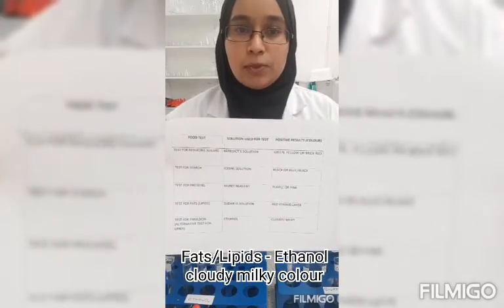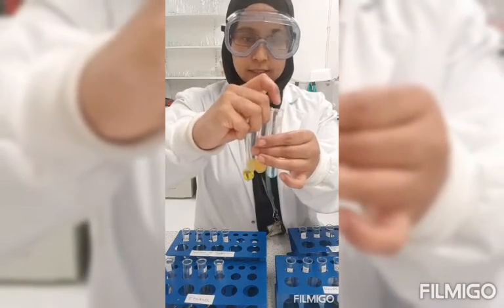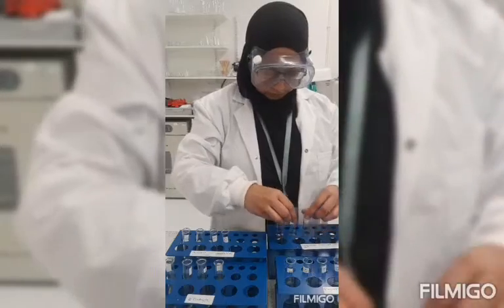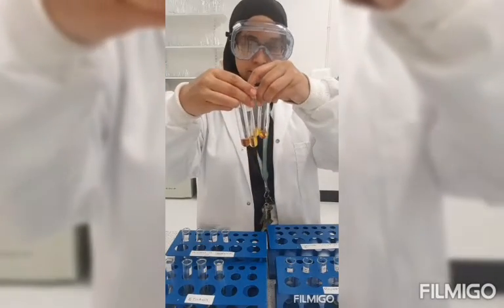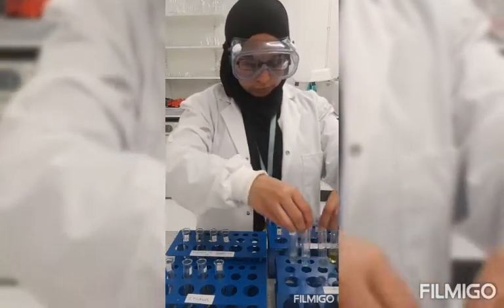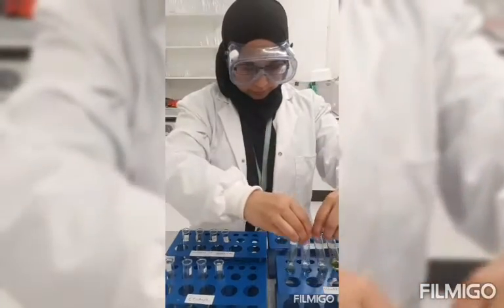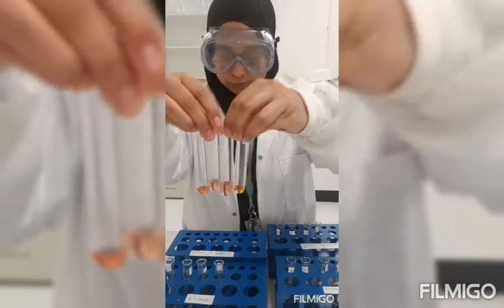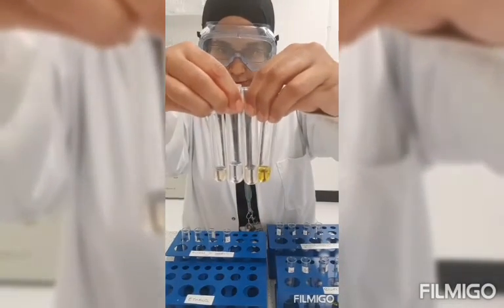For the Benedict solution, you can see that the colour has changed and the biscuit and the apple juice are reducing sugars. For the iodine solution, you can see that they have changed colour and the biscuit and the olive oil have starch in them. For the biuret solution, positive results should be purple or pink — can't really see much difference on those. For the Sudan III solution, you can see a layer of brick red on the olive oil. For the ethanol test, there is a little bit of difference in the colour, but not much.